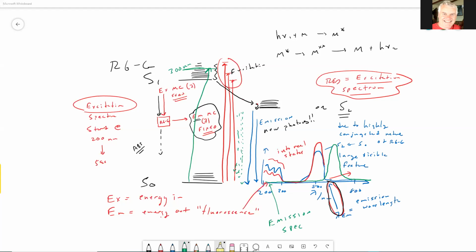And you're looking at, okay, here's a good question for Tyler. Are these Stokes or anti-Stokes shifts?